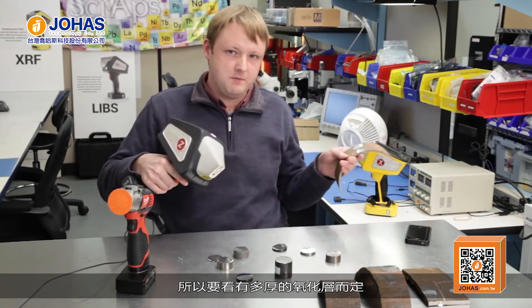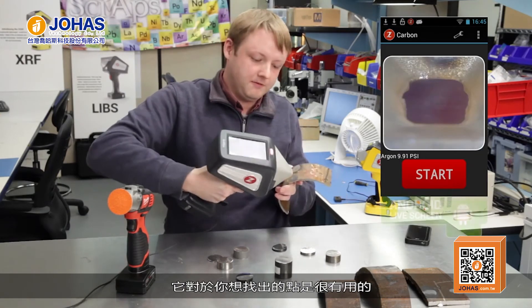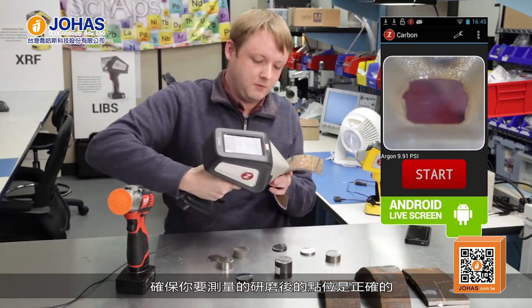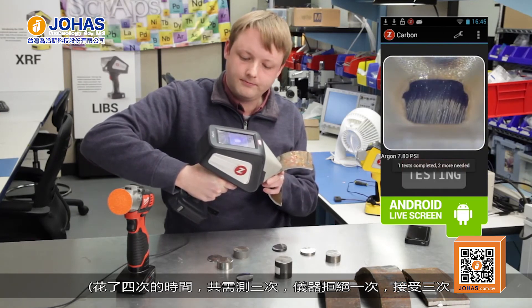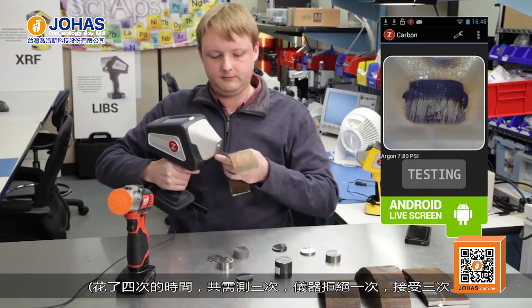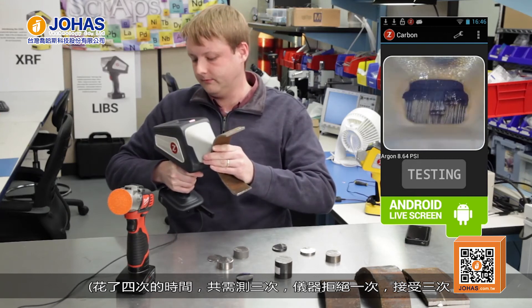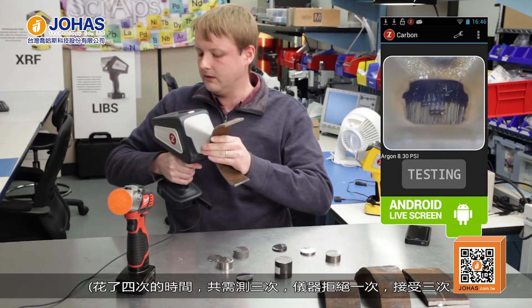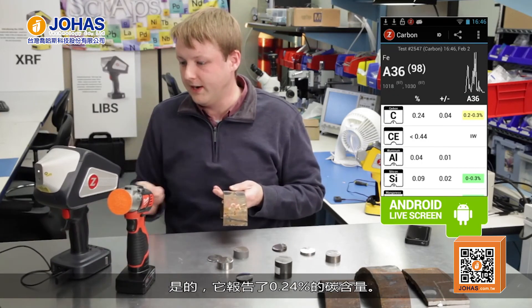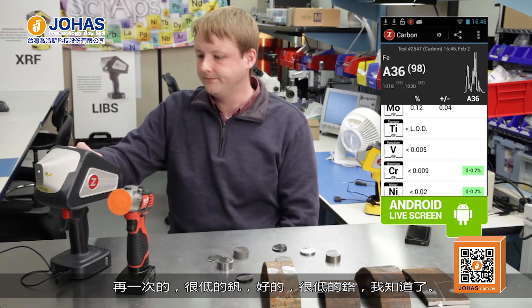The analyzer has a camera on it that's really helpful for positioning to make sure you hit exactly where you ground the sample. There's your A36 pipe sample — it's reporting 0.24%. The carbon equivalence is showing a less-than sign because vanadium is really low, and also low chrome, nickel, and copper.